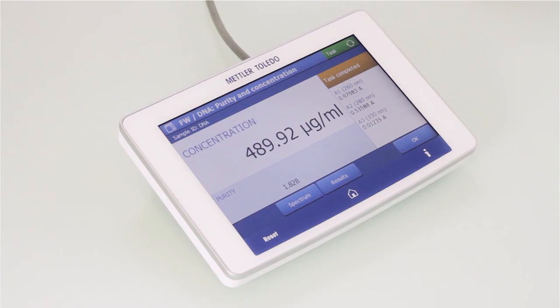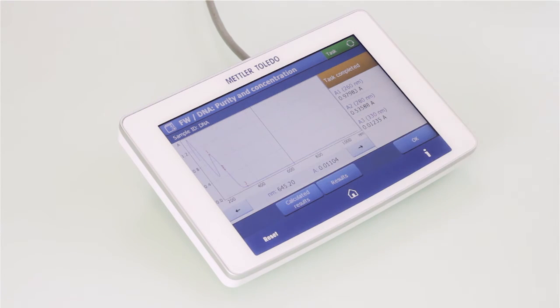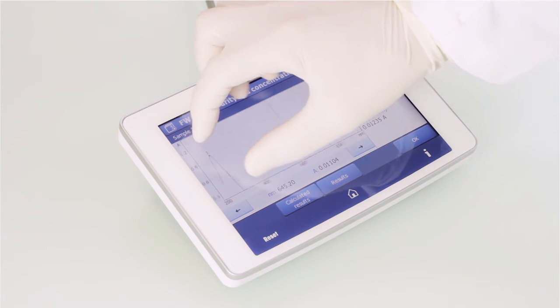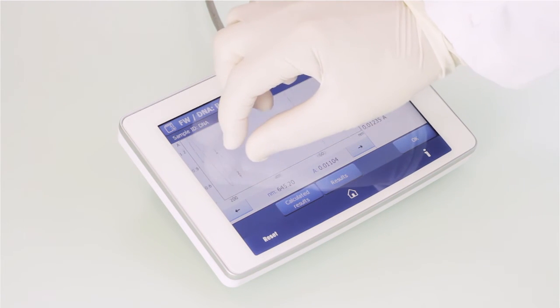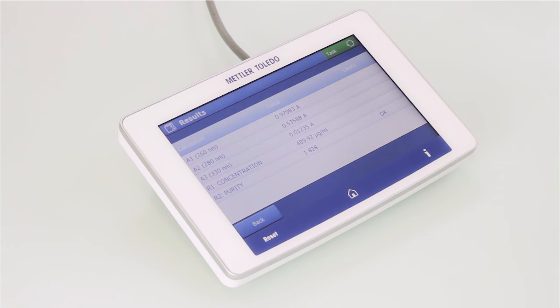The result is immediately displayed on the large color touchscreen which you can easily switch between the data view and the graphical view. Spectrum details can be zoomed in on with your fingers directly on the terminal.